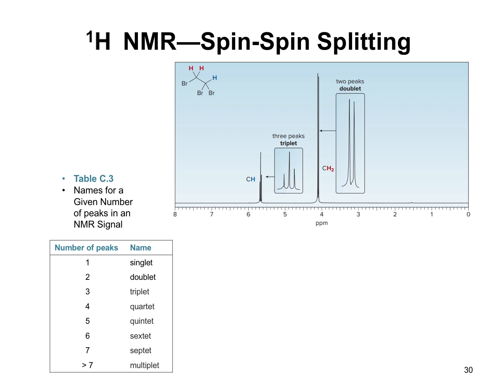Everything that we've looked at up to this point has been really limited to single absorptions called singlets. Often, peaks for different protons are split into more than 1 peak, and this is called spin-spin splitting.